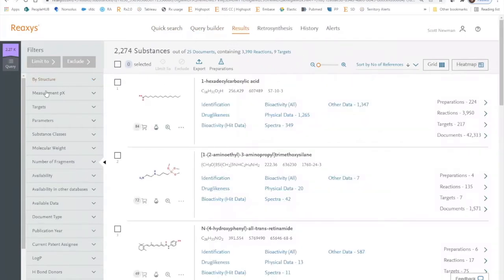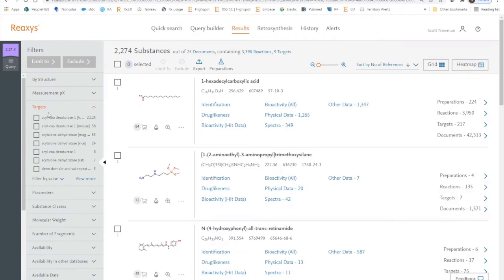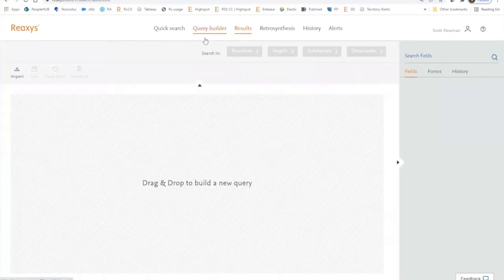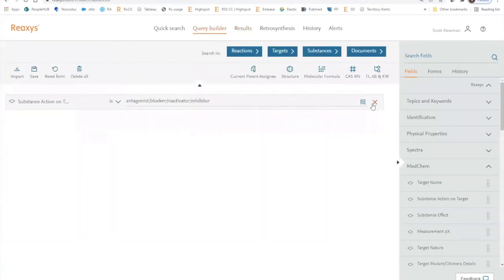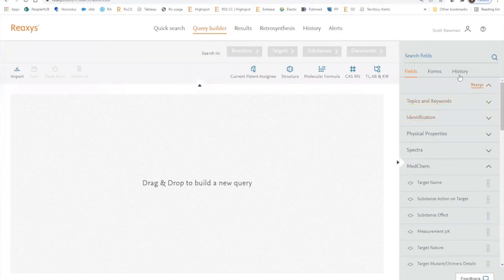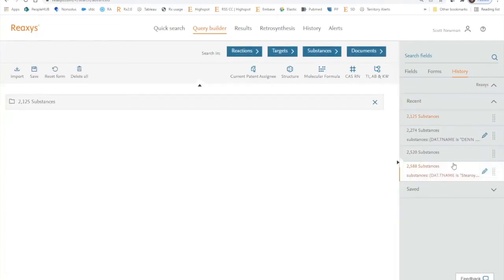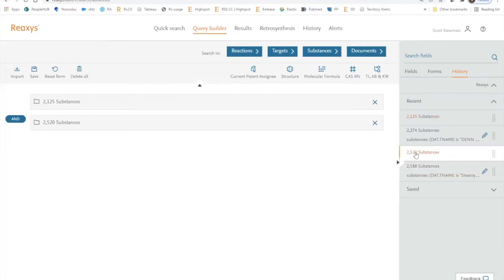We then filter those compounds for action on the human target only, and we recover 2,125 substances. We'll go back to Query Builder, clear the workspace, open up the history section, and introduce those 2,125 substances into the workspace. I previously performed an identical search on SCD5 and recovered 2,520 substances that inhibit SCD5 that act on only the human target.